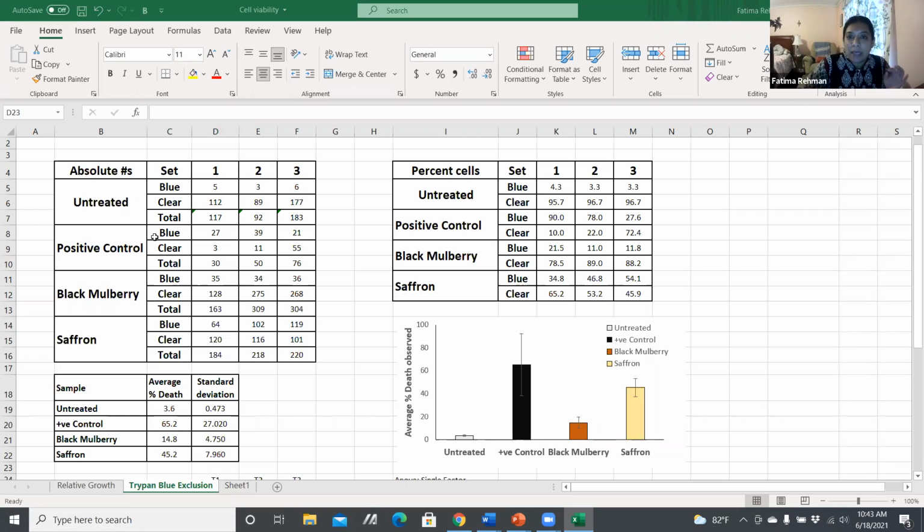Now I've purposely made this data so that the taxol, if you look at that, looks a little bit different than some of the others. What's that difference that you see? There's a pretty enormous standard deviation. Exactly. So what does that show? The enormous standard deviation, what does that show about that sample? About my 3 replicates, what does that indicate?